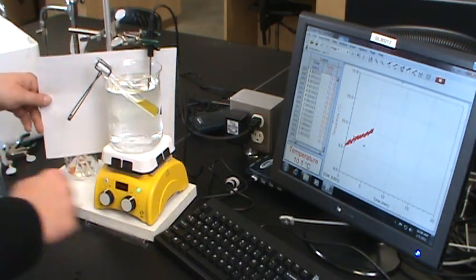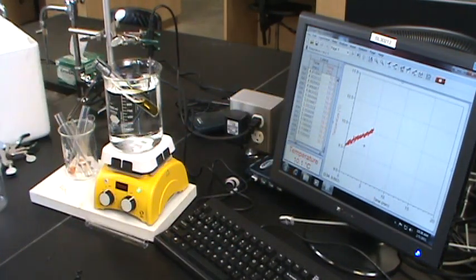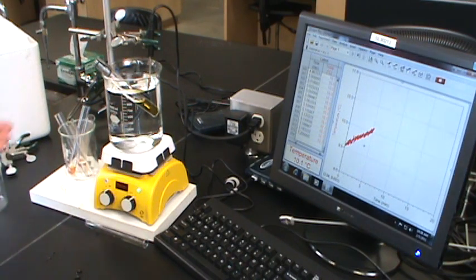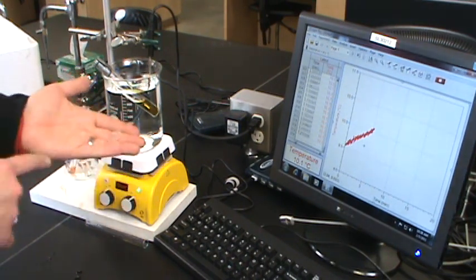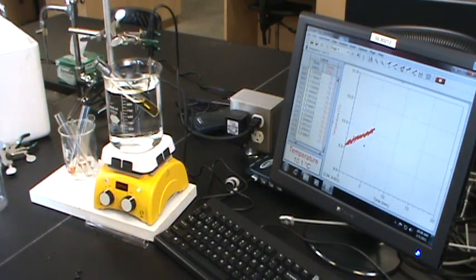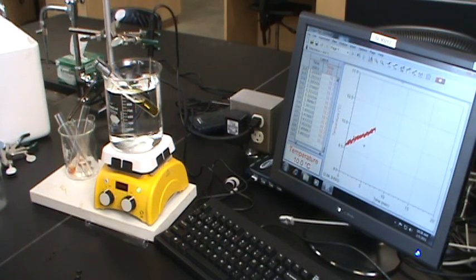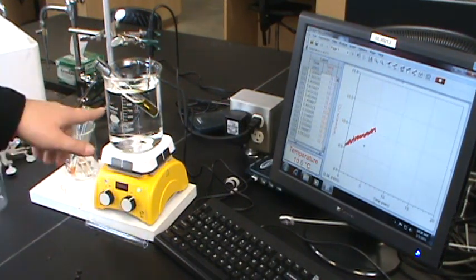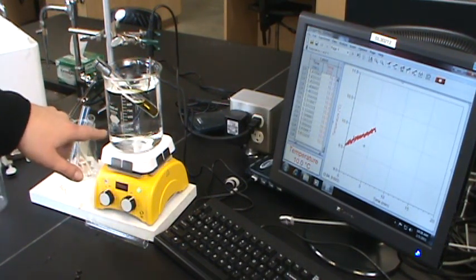Now you see that I've just crept up on my temperature to about 10.1. So how do we maintain a good temperature? Well, we can just throw in ice, and here you see this is just two tiny little pieces of ice, and let's see how much of an effect that has on the temperature of the bath. Let's slow it down a little bit. Is it going to cool? If not, we can always grab a couple more little chips of ice. It really doesn't take many chips of ice to recool this down.